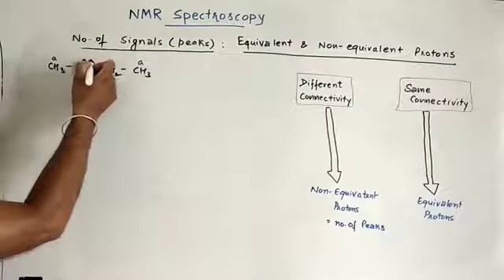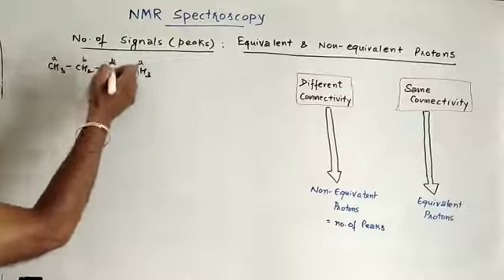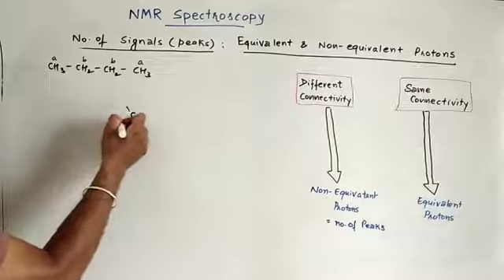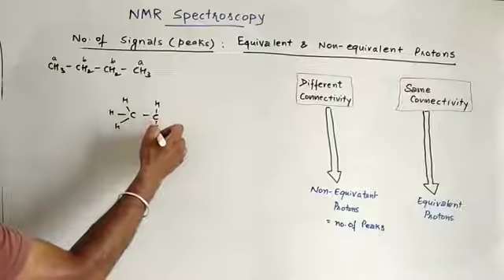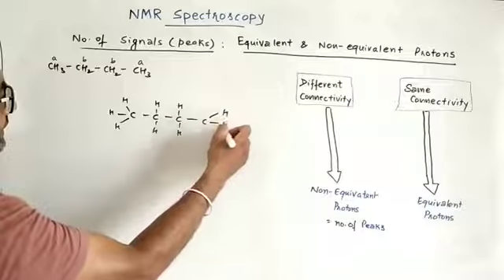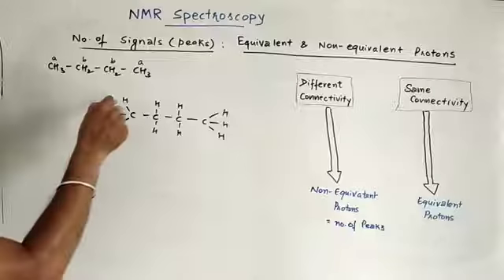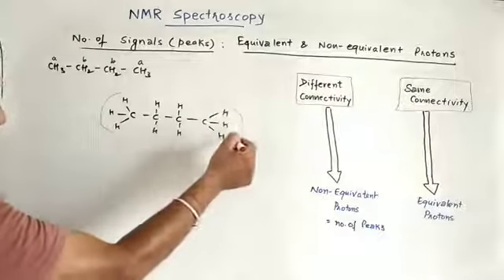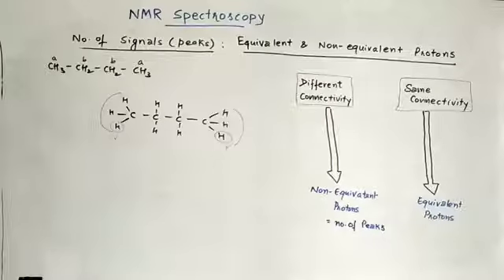These two protons and these two protons are equivalent. You can see they are equivalent. Just let me explain by opening this structure. These three protons are of methyl. These two. This molecule is quite symmetrical, you can see here. Now these three protons are equivalent with one another. These three protons are equivalent with one another. Now compare these two. These are also equivalent.